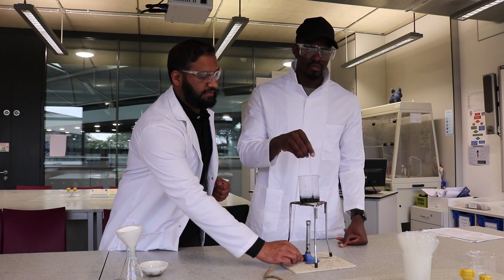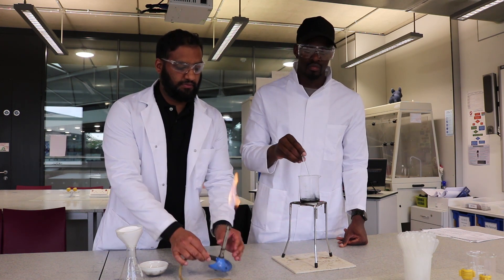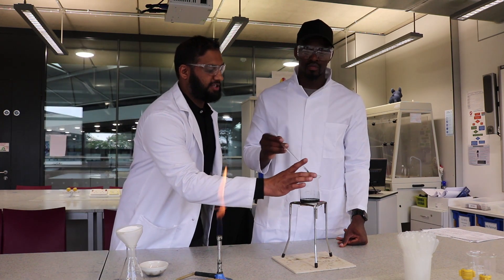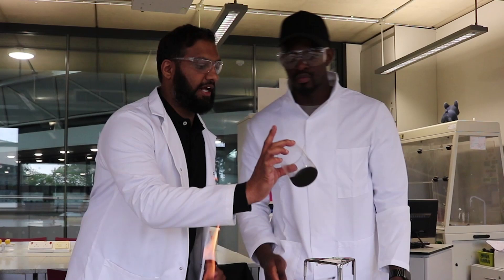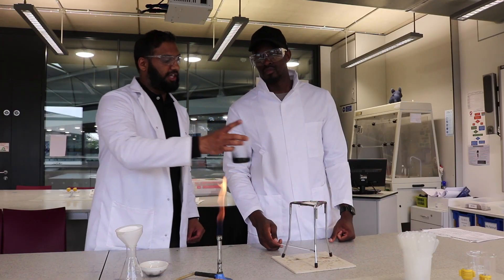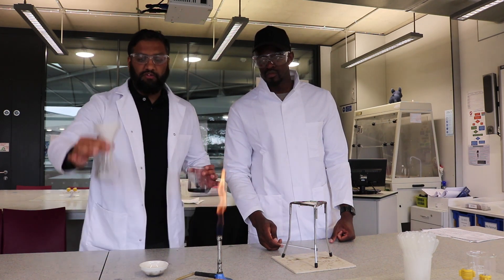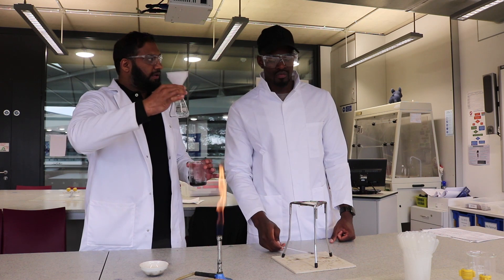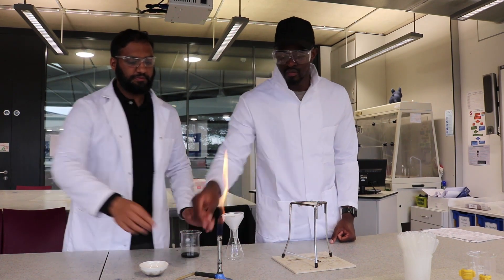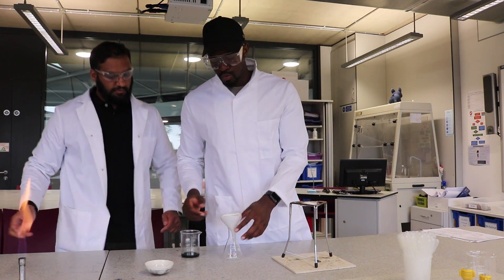We're starting to see the blue tinge even better now. Next, we're going to use a conical flask and some filter paper to filter the mixture. Pour it in there — yes, go ahead.